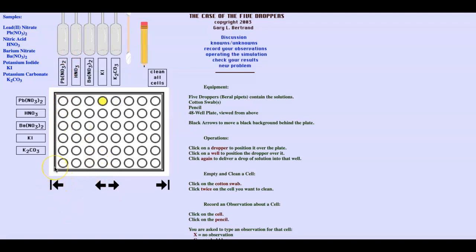Right? And so I see when I reacted the lead 2 nitrate and potassium iodide, I can see that yellow forming. That's actually a solid precipitate. I'll show you that one this week. That's an easy one to show you in a test tube. Can't show you really in a well plate, but you can see it here in a well plate.